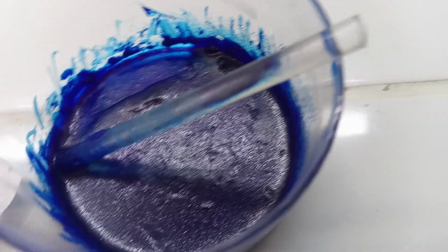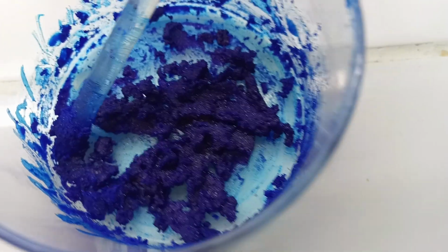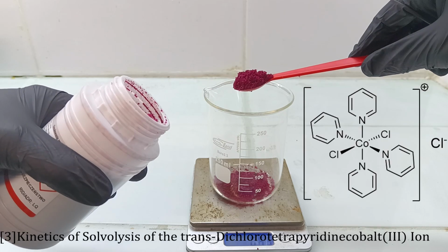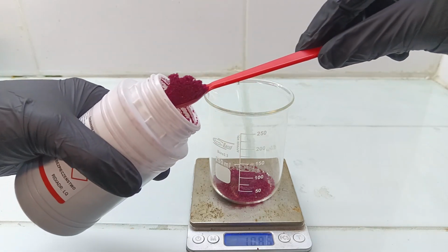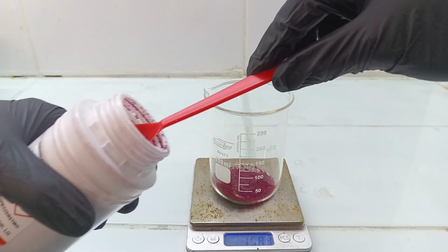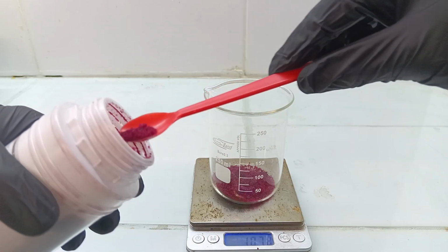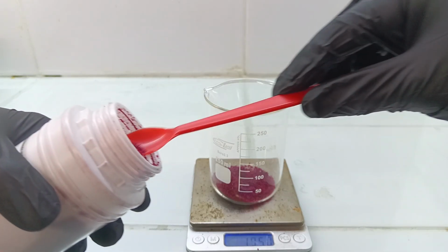The paper we discussed earlier mentions that the blue form can be isolated from hot alcohol, as long as it's kept in anhydrous conditions. As for the third complex, trans-Dichlorotetrapyridinecobalt(III) chloride, the preparation is a little bit more involved, since it requires the use of chlorine gas to oxidize cobalt 2+ to cobalt 3+, so do not attempt it without the proper PPE.